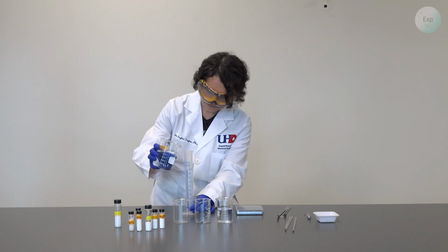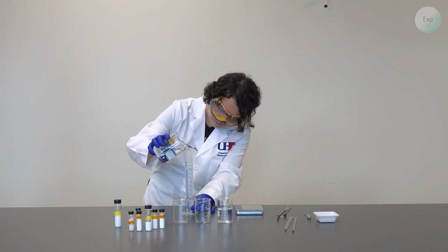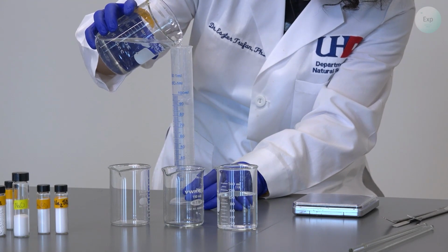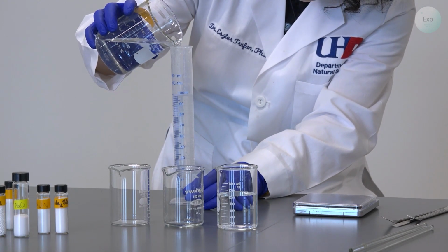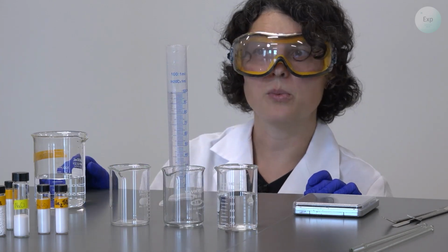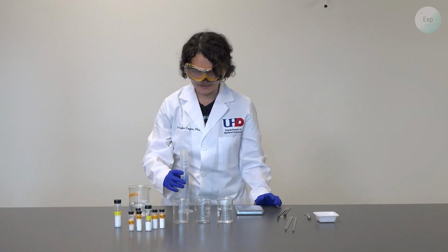Then we repeat. For our second measurement, we are exactly at the 100.0 milliliter mark.